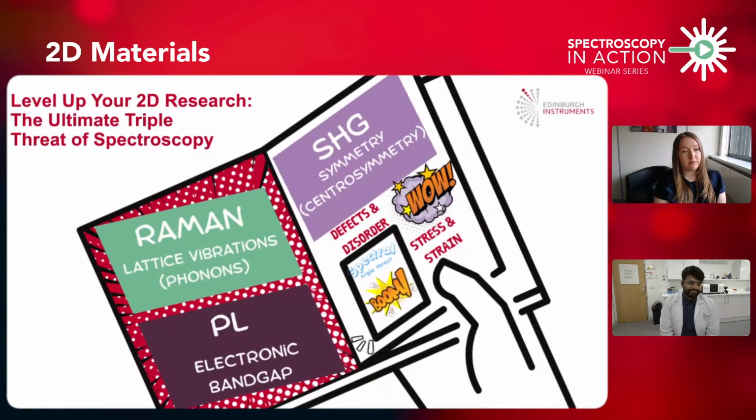Thanks, Nikesh. I have a quick conclusion here, but overall, Nikesh has given us a really detailed and thorough conclusion there. So, headlines: Raman spectroscopy excels at probing your lattice vibrations, aka your phonons. Photoluminescence is the primary tool for investigating the electronic band gap, and SHG comes in at the end to uniquely determine the symmetry within a non-centrosymmetric material. All of these provide information on defects and disorder. They can all help to identify any stress or strain. But by employing all of these, this ultimate triple threat of spectroscopy, you can gain a much more comprehensive understanding of the structural, electronic, and defect properties of your 2D materials.